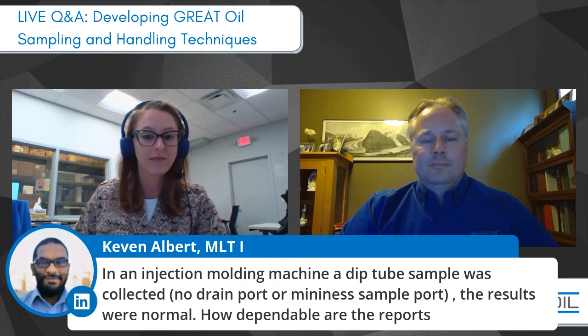Right. Very true. And let's see, we also had a question here from Kevin, so I'll throw that on the screen as well. He asked, in an injection molding machine, a dip tube sample was collected, no drain port or a mini mesh sample port. The results were normal. How dependable are these reports?